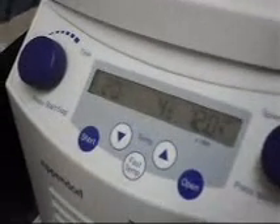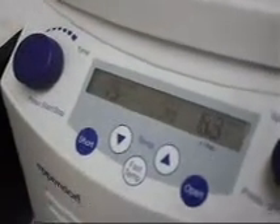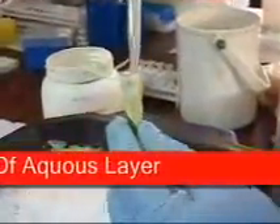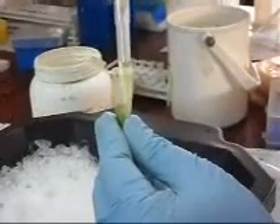The ground sample is centrifuged at 10,000 RPM at 4 degrees Celsius for 15 minutes. After completing the centrifugation, the supernatant is collected in a fresh Eppendorf tube and stored at minus 80 degrees Celsius for further use.